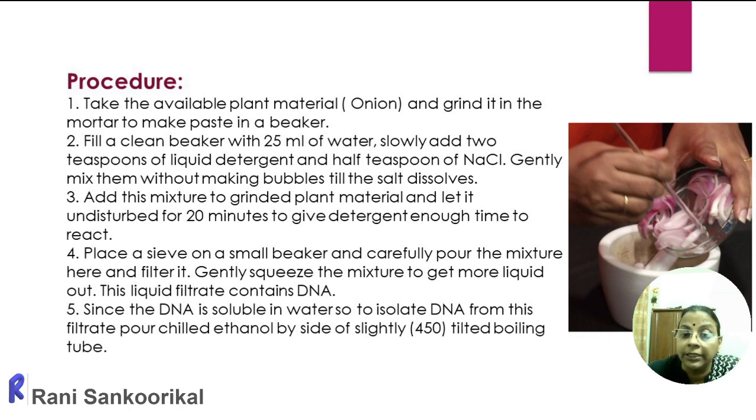Then take a bowl, or you can take a petri dish or even a test tube. Individually, when you are doing it, a test tube will give the best results. For demonstration purposes you can use a petri dish or a glass bowl, then it will be easy. So take a glass bowl, petri dish or test tube, and half fill it with chilled ethanol, the freshly chilled ethanol that is directly taken from the fridge.